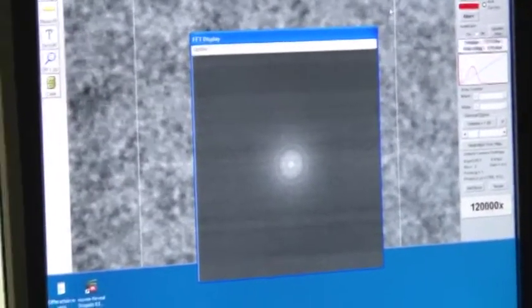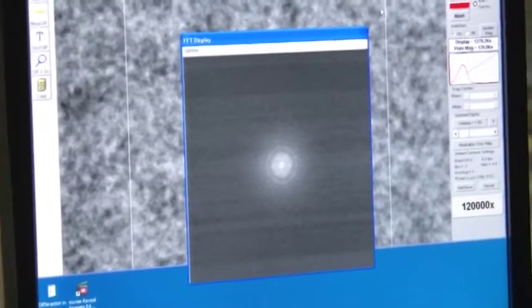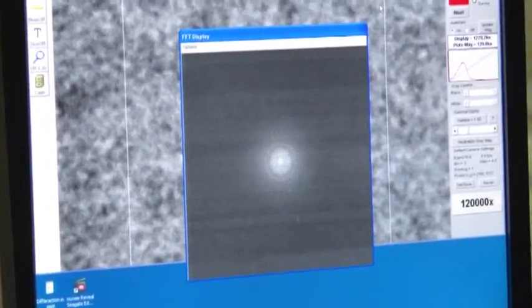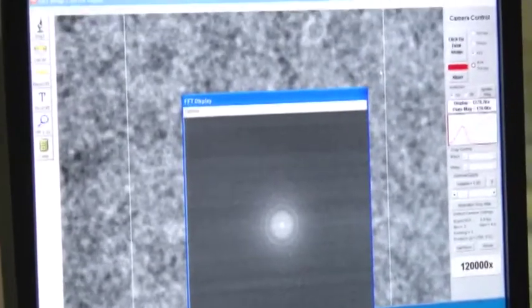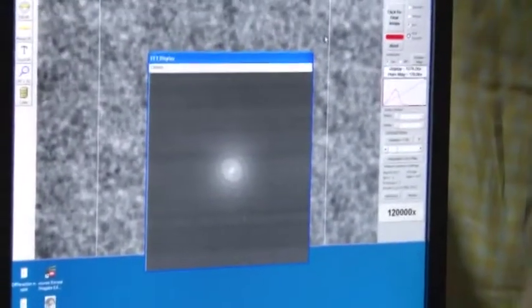You can say that you are in focus, you have to find that focus, and as you can see, you just rotate the knob, you will end up in over or under focus, or something like least contrast. I made it deliberately astigmatic, so may I now suggest you go even further, just a little bit, and just remember your rotation direction to see what changes in the image.